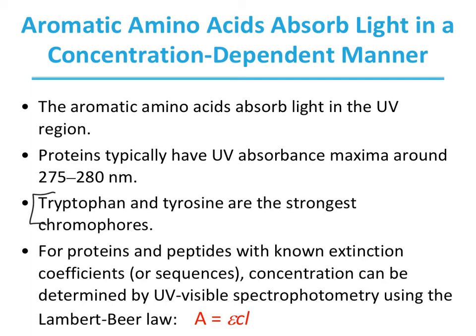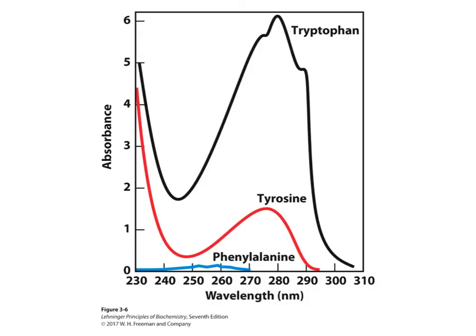This shows a comparison of the light absorption spectra of the aromatic amino acids tryptophan and tyrosine at pH 6. The amino acids are present in equimolar amounts under identical conditions. Notice that the measured absorbance of tryptophan is as much as 4 times that of tyrosine. Light absorption by the third aromatic amino acid, phenylalanine, generally contributes little to the spectroscopic properties of proteins.